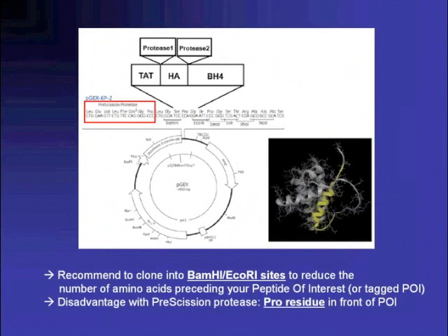When it's a hydrophobic peptide, I have to say we have experience. I think it might be issues that they become an inclusion body. So I would say you should check it's not aggregated. If it's not, and the problem is that it cannot be easily accessed or is protected in that kind of thing, then you might want to use the Sarkosyl to get it in a more accessible state. That would be my recommendation, but I'm not sure whether this is a good answer.